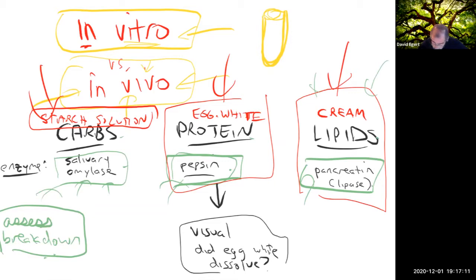For the cream, for the lipids, I am going to add a pH indicator to the cream.